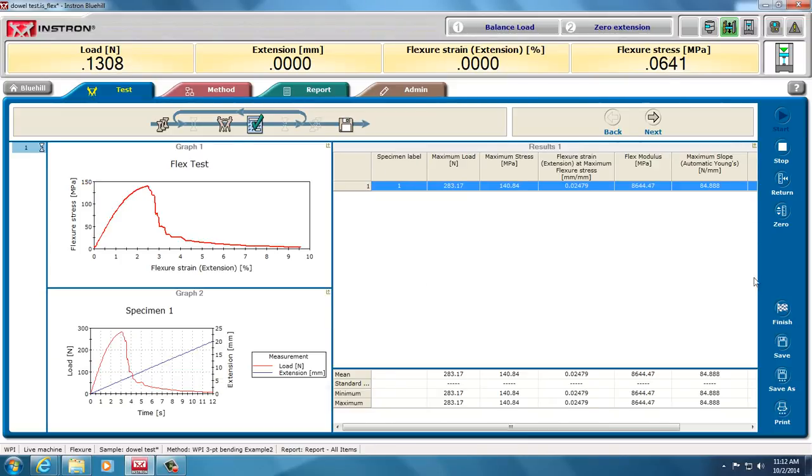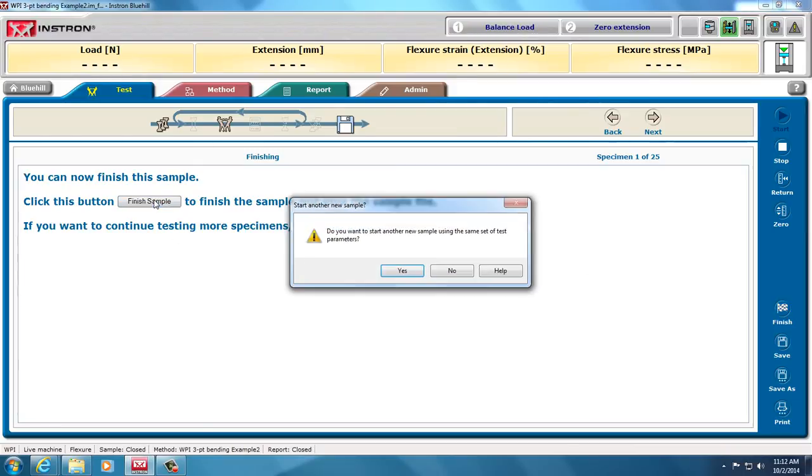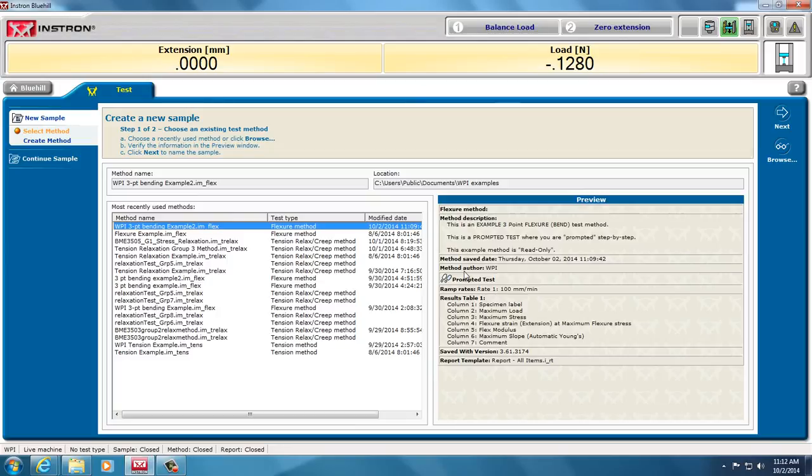And if I finish the sample, it will save my file, the raw data file. If I do not hit finish, it will not save my raw data file. And that's the end of the flexure method.